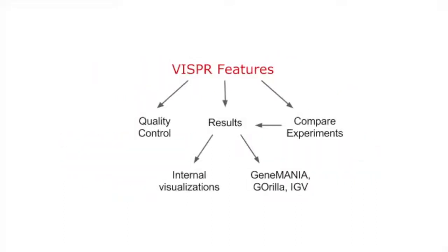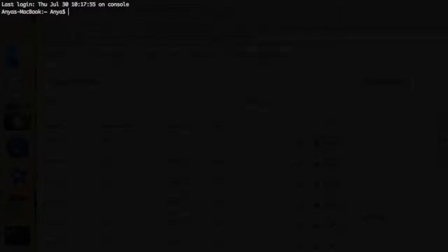In this video, we'll demonstrate how Vispr displays quality control measurements. If you don't have MAGIC Vispr installed, click here to learn how. Once you do, you can follow the directions for configuring data for Vispr in this video or open up the Vispr demo file directly by running Vispr test.